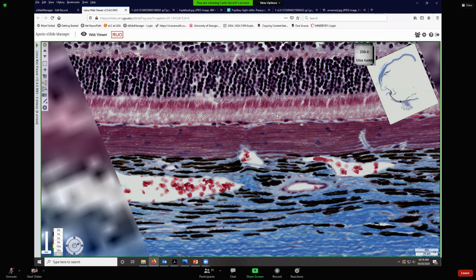And if it didn't excite a photoreceptor cell right here in this layer, then it would pass through the pigment epithelium, pass through the choriocapillary layer, hit that tapetum and bounce off it like a trampoline, and be reflected back and get a second shot right here at activating those photoreceptor pigments. So that is what the tapetum is for.